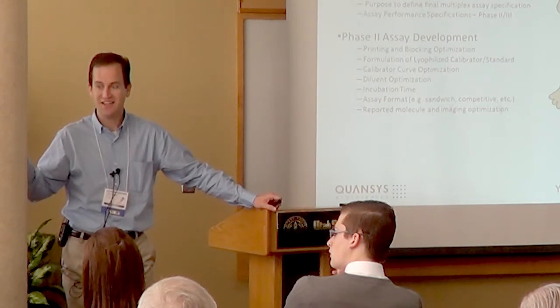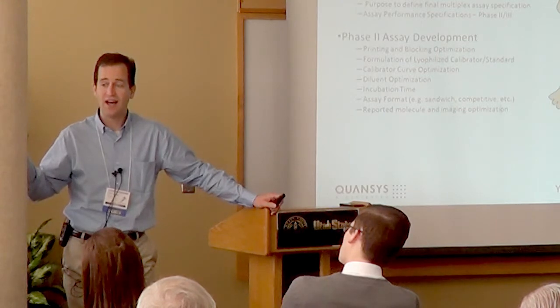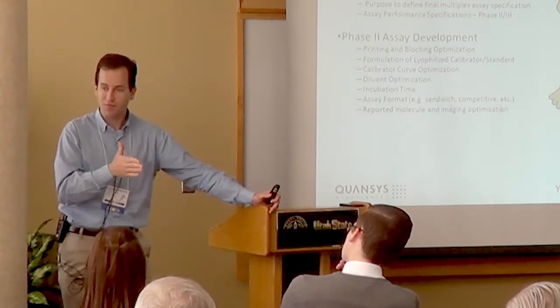Right. Is that an unwarranted concern? It's not unwarranted. As we say all the time at Quansys, if you're going to do something and it's wrong, that's fine. Do it wrong the same every single time. Obviously it's better to do it right, but with an ELISA, be consistent in what you're doing. And that's exactly what it sounds like you're trying to do, because you want to make sure you get that little flake off the top of that thing. So I would, if I were doing it, invert the vial and then pull it back down. Even with 100 microliters, you should have sufficient to be able to pull out what you need.